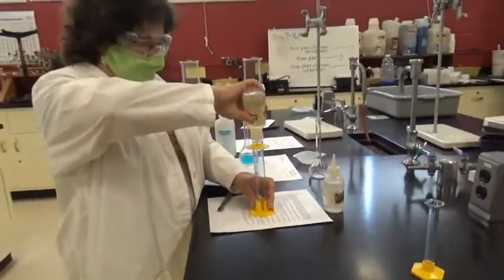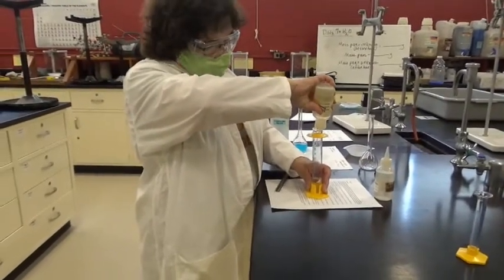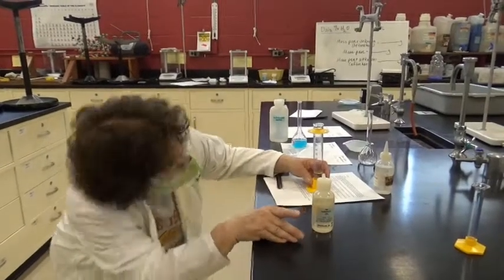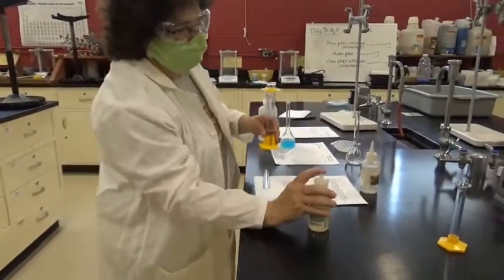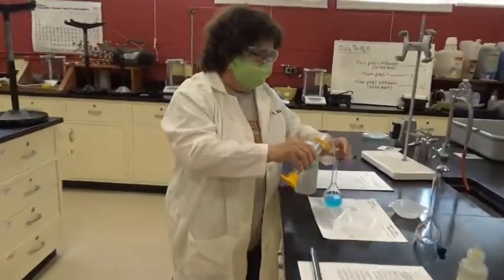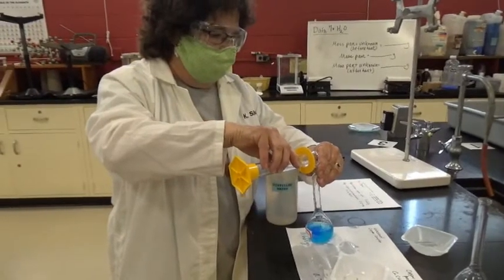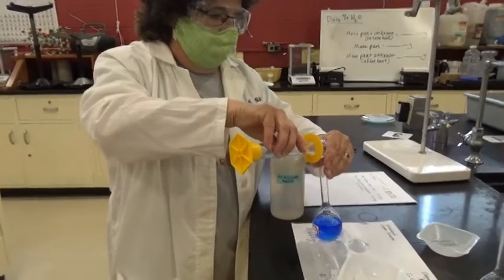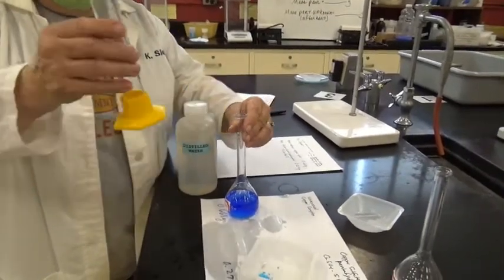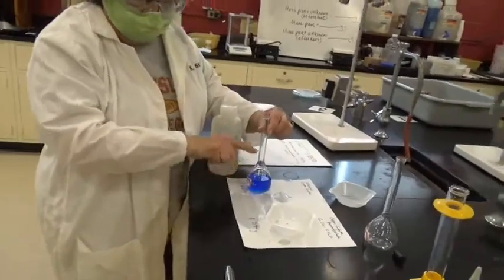So the one thing I don't want to do is put too much liquid in the volumetric flask too quickly. Let me see. Oh my gosh, it's perfect. Good. I'm going to close it up. So both solutions are going to be made the same way. And I'm going to carefully, again, pour this in. You'll notice the color changed. Now, the volume of this isn't really critical to this, but the volume in here is critical.